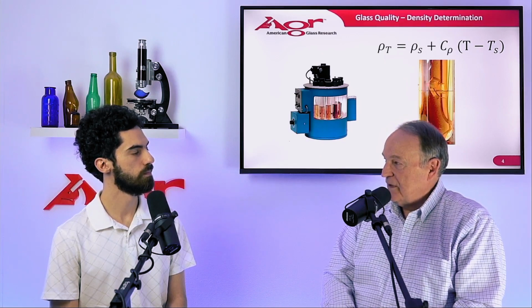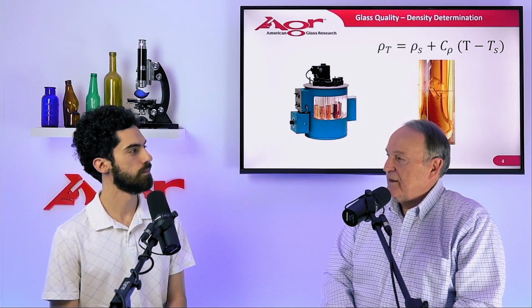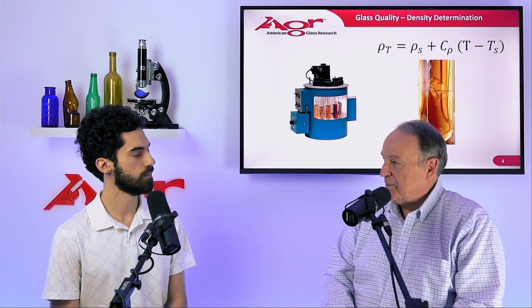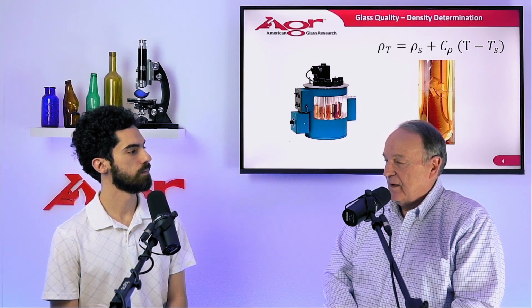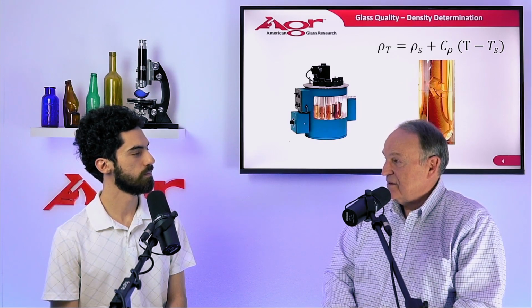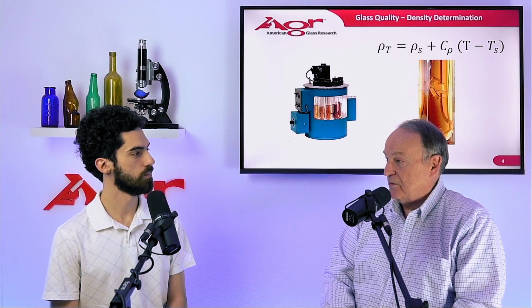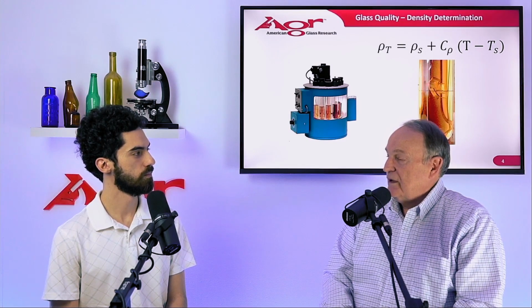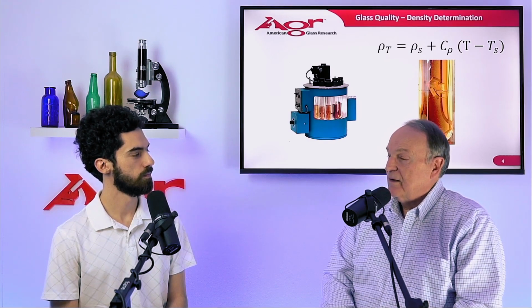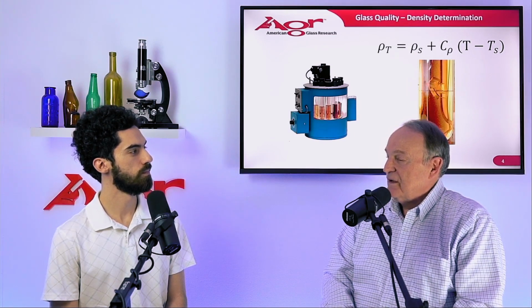There's a heating element in the water, and by slowly heating up the temperature of the water, that temperature will progress through the wall of these test tubes and heat up the oil at a very controlled level.